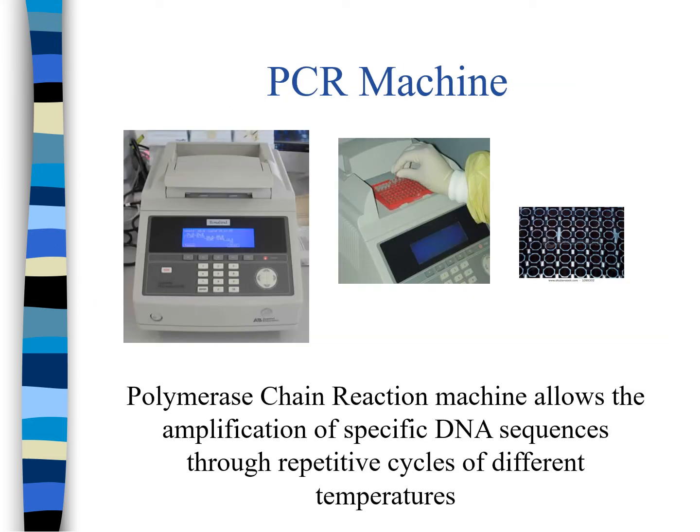Now, when we mix all of these components together, the Taq polymerase, the template, the dNTPs, etc., we are ready to put them in the PCR machine, and then we set the cycles. We'll talk more about the cycles later on. We set the program here. We tell it to go for 36 cycles of repeating denaturation, annealing, and extension. Leave it for about an hour and a half, and it will give you billions of copies of the specific DNA. Then you can take the sample and proceed with gel electrophoresis.